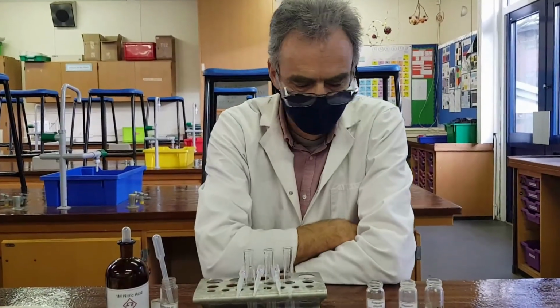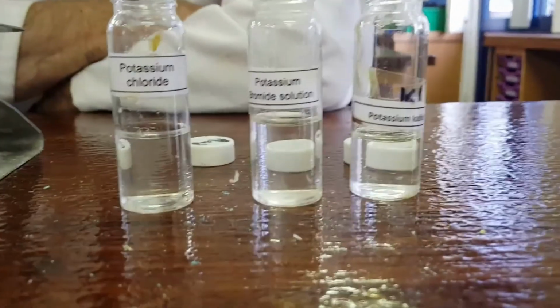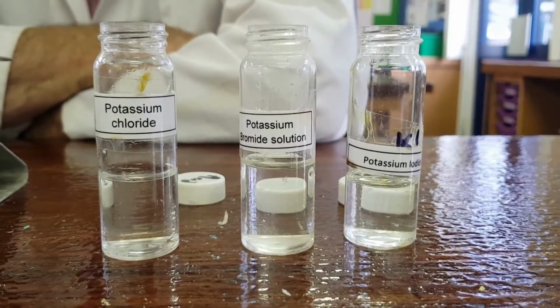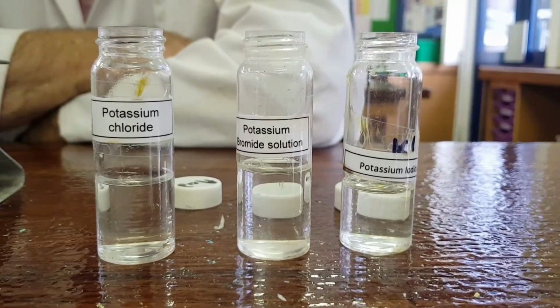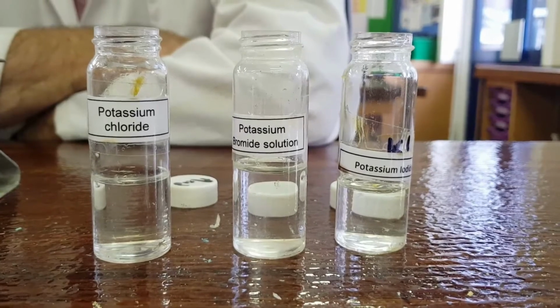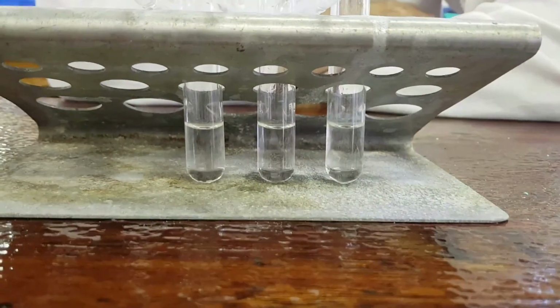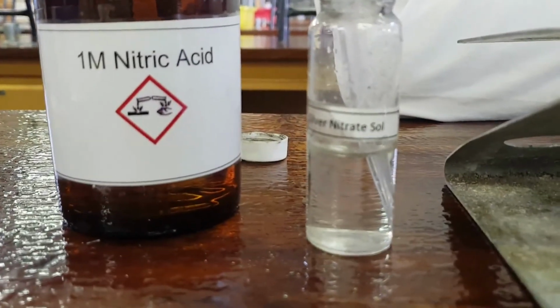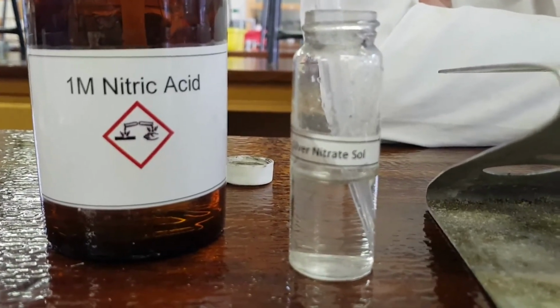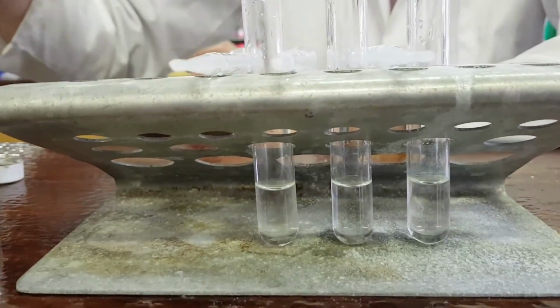So in this video, we're going to be looking at identifying anions, the negative parts of a salt. And here you can see we've got 3 solutions: potassium chloride, potassium bromide and potassium iodide. And because they all contain potassium, you know that any differences are going to be due to the negative part of the salt, the halide, the chloride, the bromide and the iodide. And we're going to be testing these 3 solutions using silver nitrate solution. But we're also going to be adding nitric acid. And this is to make sure that any impurities are removed from the solutions before we test them.